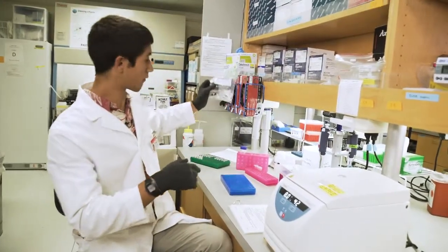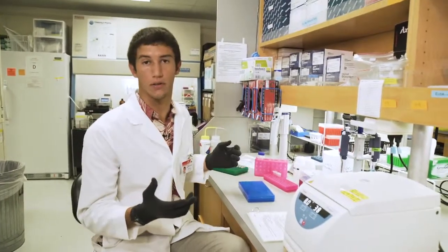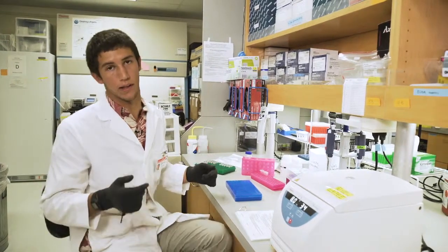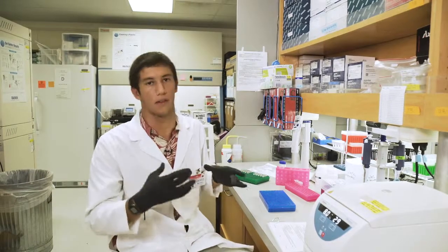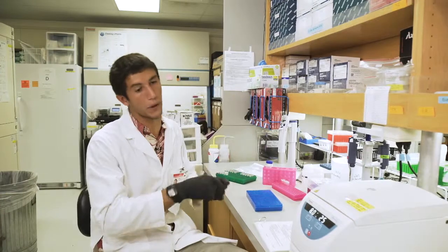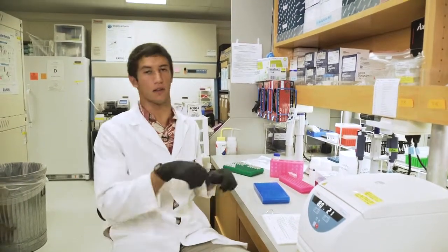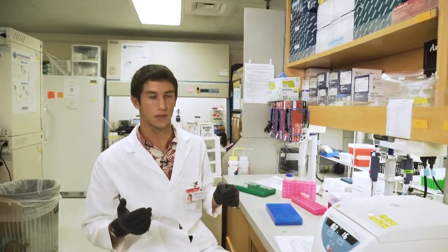When those come through, we're going to have in the bottom, in the collection tube portion, not the filter, mostly junk. So we added the ethanol, and that precipitated out the DNA, which made it solid, right? And so the solid's going to get stuck on that filter on the top. And that's good, but everything else that goes through is going to be junk that we don't want. So that's going to go into a beaker, which will then be placed into hazardous waste.